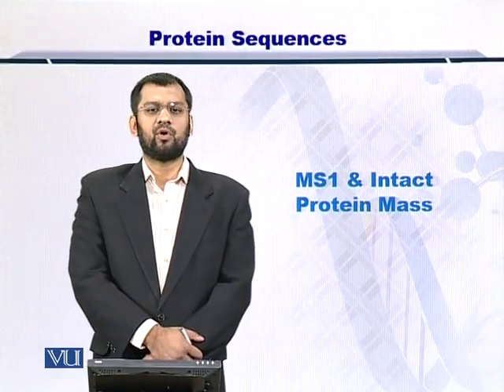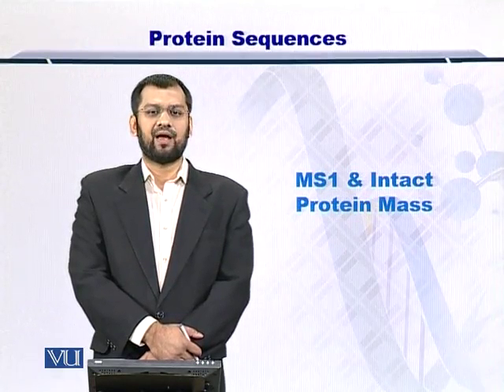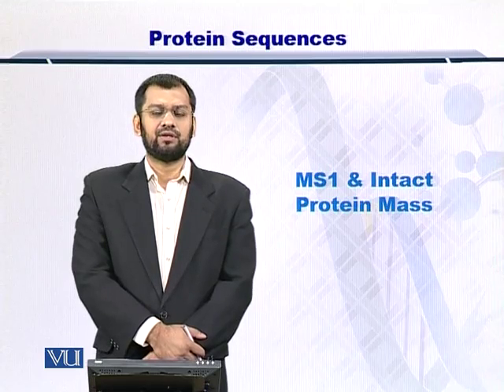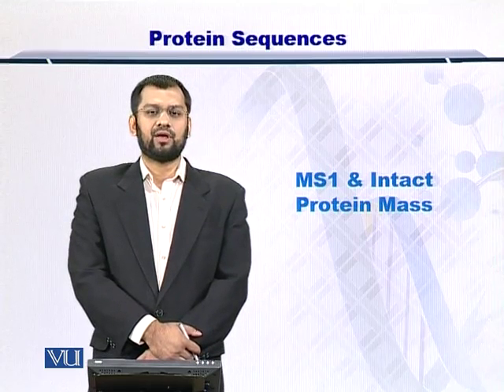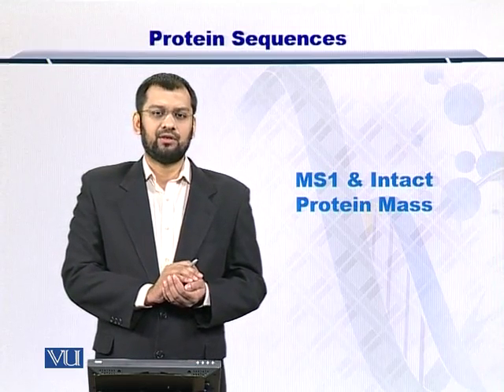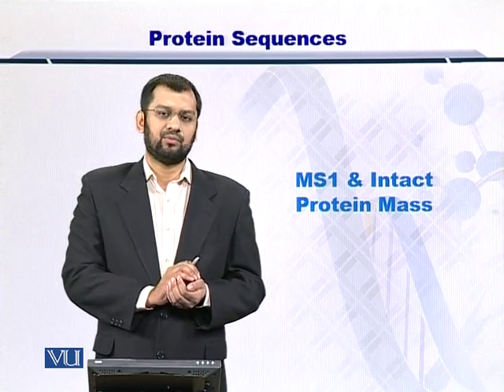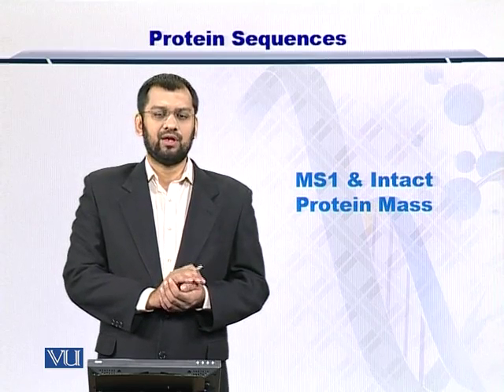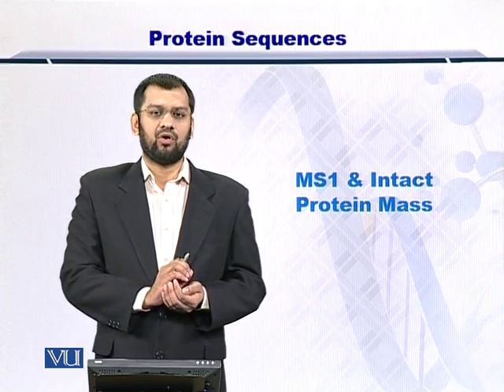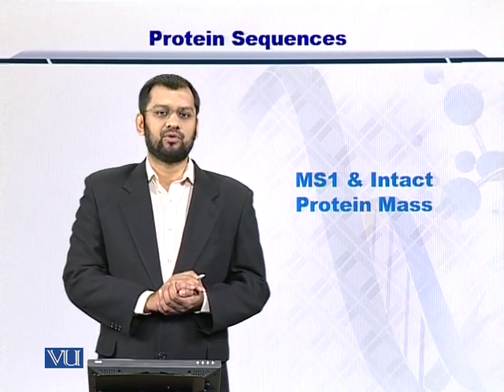Dear students, in this module we're going to look at MS1 and the intact protein mass measurements. Before I begin with the content, let me point out that if you are doing bottom-up proteomics, then I'm referring to a peptide, and if you're doing top-down proteomics, then we're referring to a protein. So here I mean intact molecular weight measurement of your precursor molecule, which may be a protein or peptide depending upon the protocol that you're using.